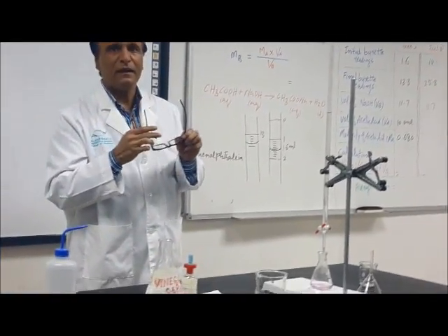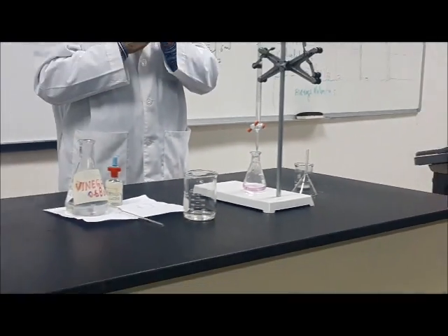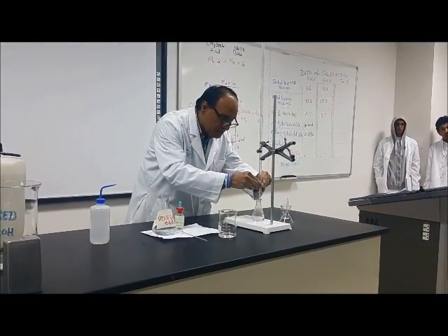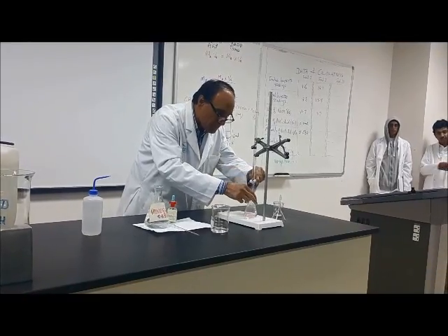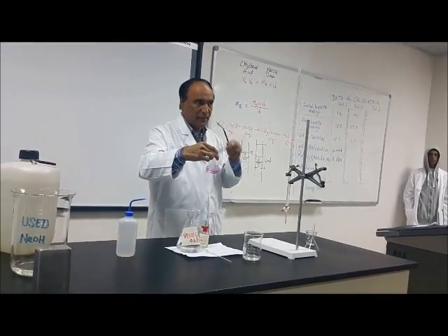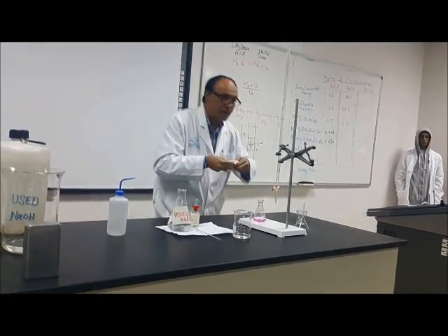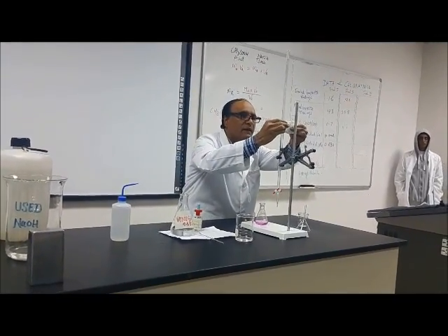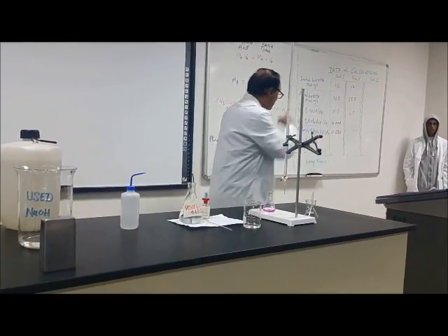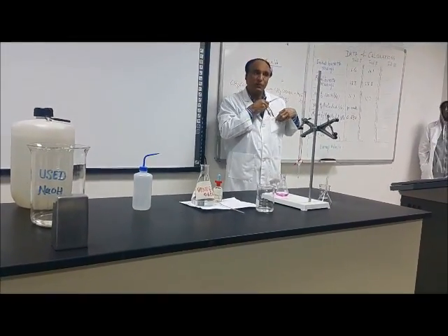Okay, but I left it like that when I make the experiment. It's good. Yeah, it's very good, because when there is a color change, that's the end point. Okay, and now I will take the reading. 25.8. Same. Same. 25.8. Okay, boys. Now the reading is 25.8.